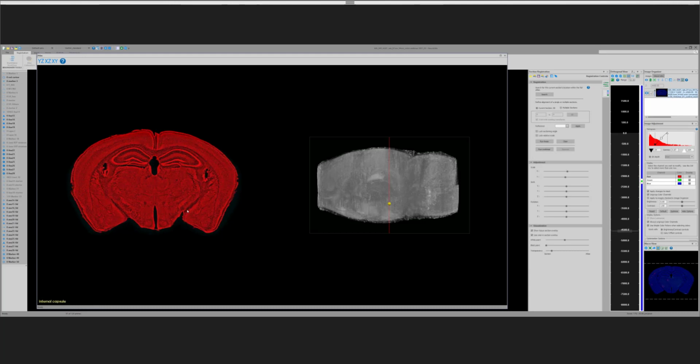Similarly, there are other fiber tracts that give us a similar indication, like the optic tracts as they come into the brain; where they're located gives us an indication of where we are. The mammillothalamic tracts, the shape of structures like the amygdala, the basolateral amygdala. Rostrally, it just starts, and then we can estimate where we are located in the Z dimension based on the location of these structures.